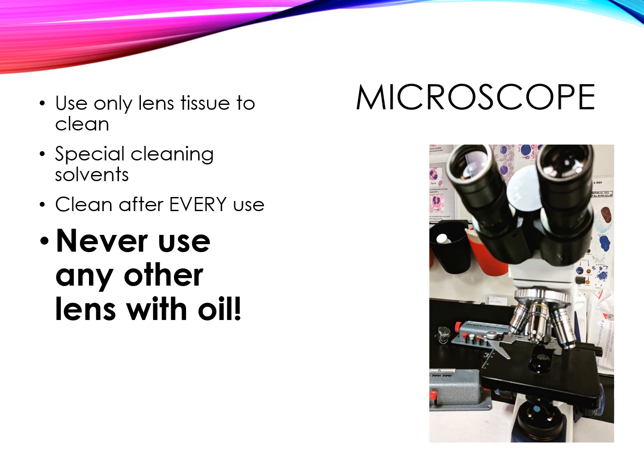So when we're going back and forth, we turn the objectives so that the lower objectives pass first and don't go over the slide. Basically, you never want any of those objectives to pass through your oil on the slide.